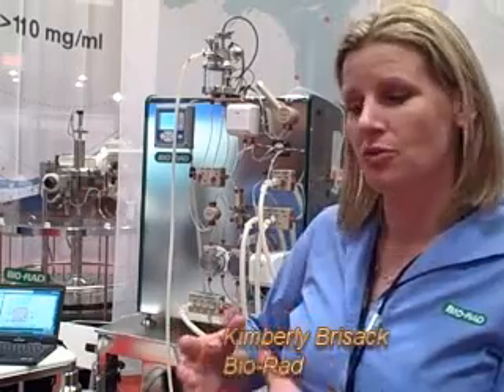You can do full unpacking, packing, and processing all with the same system and the same traceability. This is also scalable — we can scale up to about a meter, maybe bigger. Of course, you're not going to have a bench top skid anymore, but you have the same software interface that's scalable, and we can do all of the functions necessary for processing in a chromatography environment.